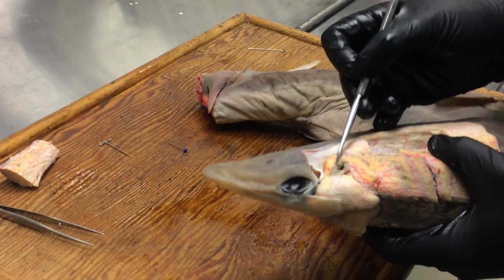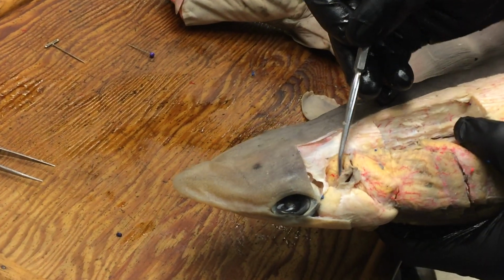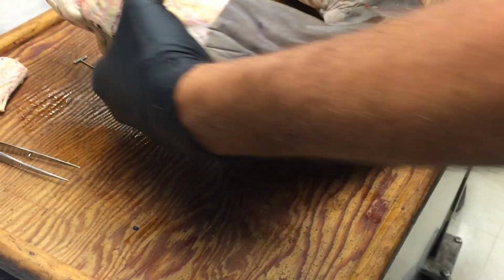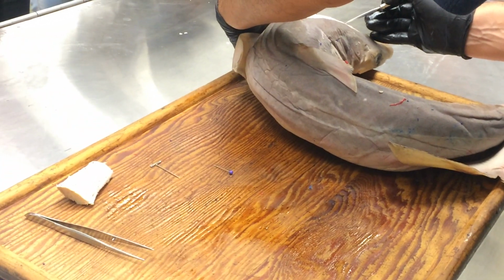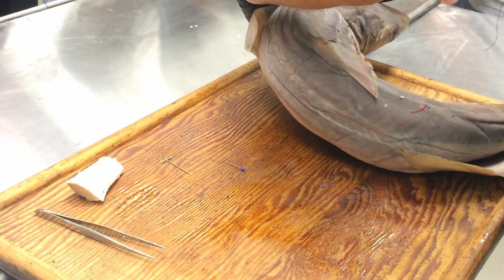Just behind it, there's a little tiny muscle that you can see right there that runs down into the front wall of the spiracle. You see that? This guy right in here. And that would be the spiracularis muscle. And that helps open the spiracle.